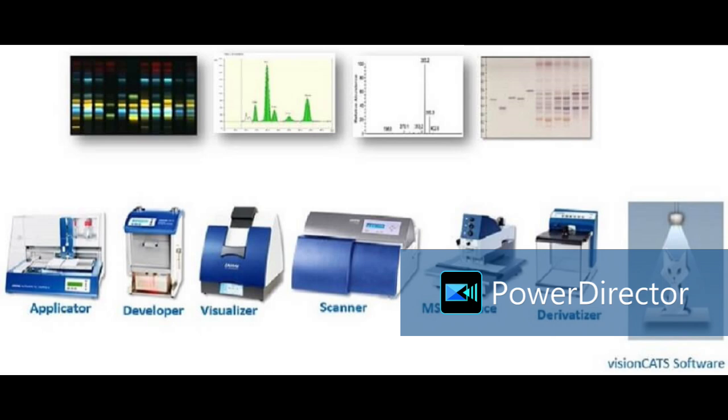Then this is HPTLC Pro, a completely automatic online system, right from sample plate storage, sample application, development, derivatization, detection, and MS interface. Everything is inbuilt, fitted together. It is a conveyor belt type of assembly. The plate goes from one module to another automatically. In the plate storage module at a time we can keep 5 plates here and 5 plates for ongoing analysis, so total 10 plates.